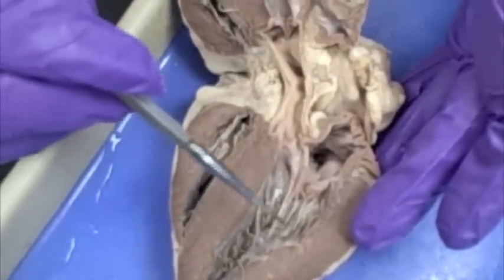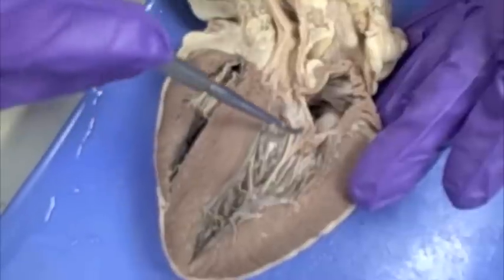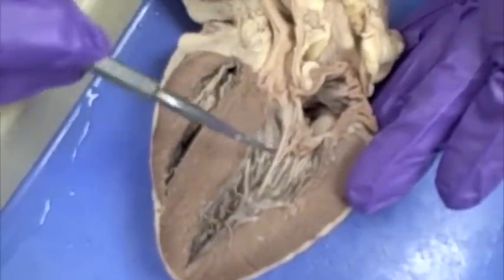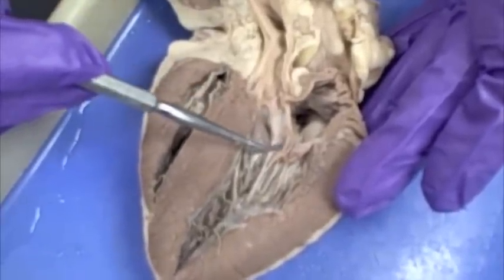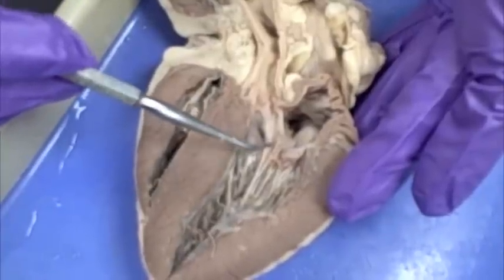Whenever the ventricle contracts, the blood is going to go back up to the atrium and the valve is going to close — it comes up like this and it closes. So the chordae tendineae are going to prevent the valve from opening into the atrium. That's how it prevents backflow.